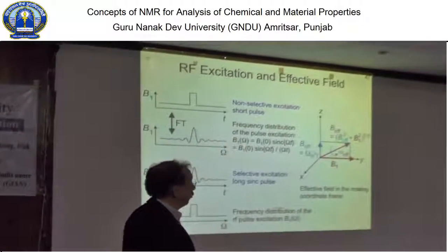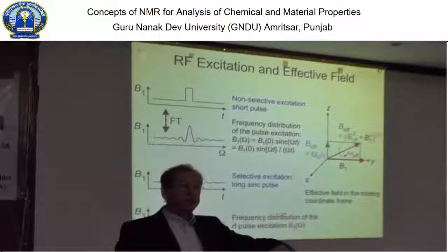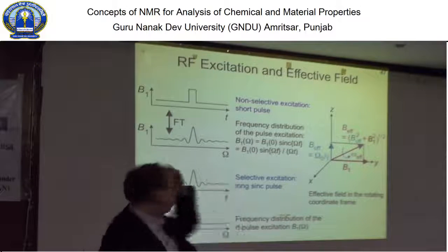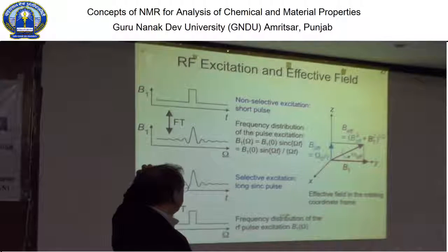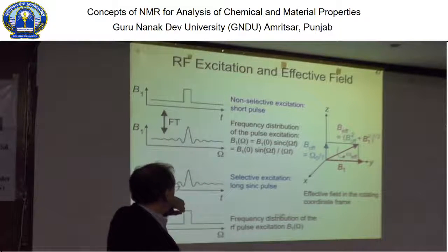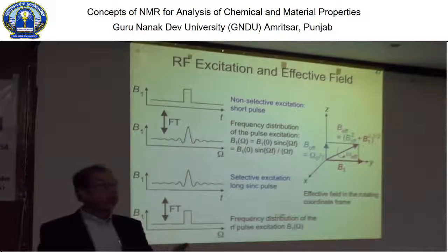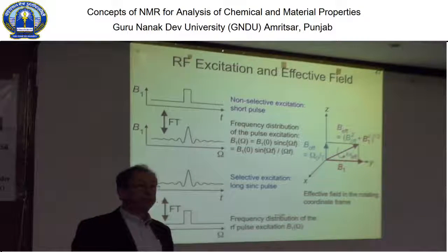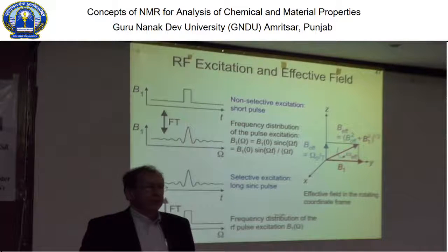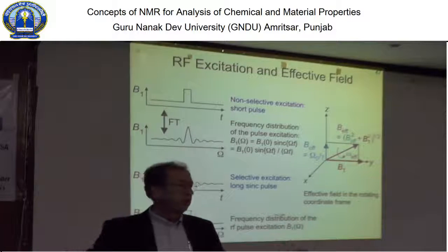You need this, and the question is, what does the magnetization do? Well, you actually have this off-resonance field, which comes from the different frequencies. The yellow bicycle rider has a small precession frequency in the rotating frame, so there's a residual magnetic field. That's his magnetic field, B off. This is the magnetic field of the yellow bicycle rider in the rotating frame. B1 is the magnetic field that is generated by the transmitter. Now the spins don't know if the magnetic field comes from the off-resonance field or from the transmitter, where does it come from?